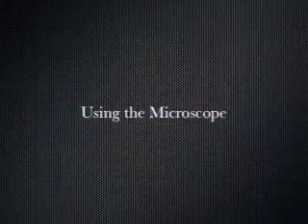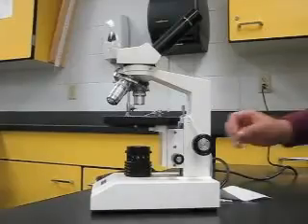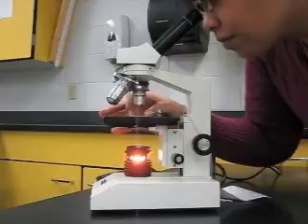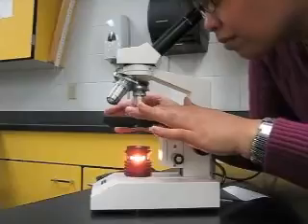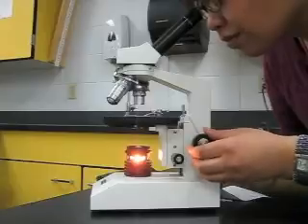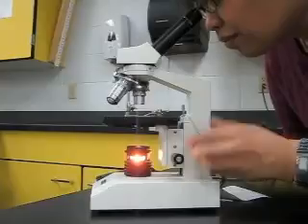Next up, using the microscope. After placing your microscope slide onto the stage, the first thing to do is to turn on the light. Once you have the light turned on, you're going to look through the microscope and make sure part of the slide that actually contains your specimen is visible through the eyepiece. Once you're able to see your specimen, you can start using the coarse adjustment knob to raise and lower the stage to put your object into focus.